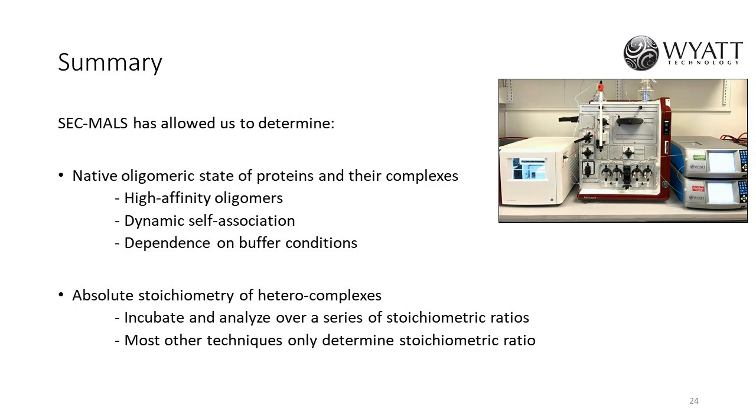It's a known fact that the NAP1 protein is a dimer. There is a crystal structure available along with a lot of studies that show that the NAP protein does not form a monomer, and the crystal structure shows the interactions.